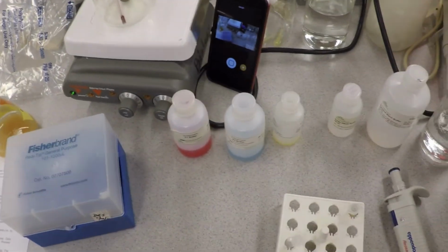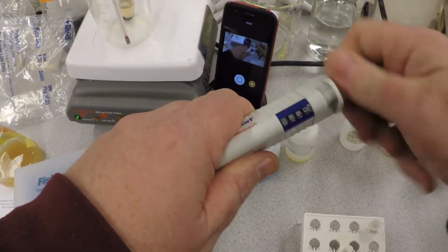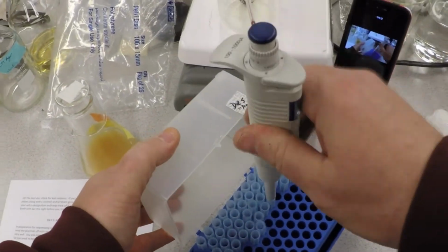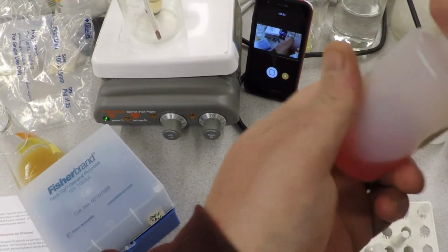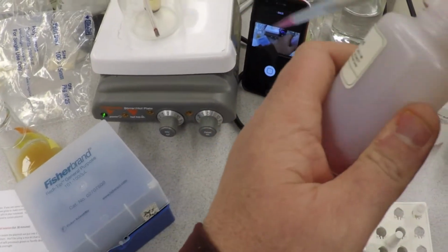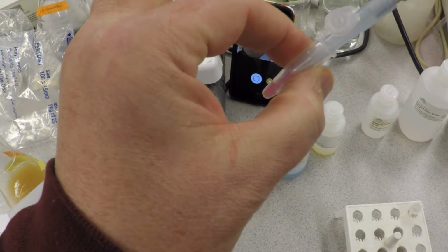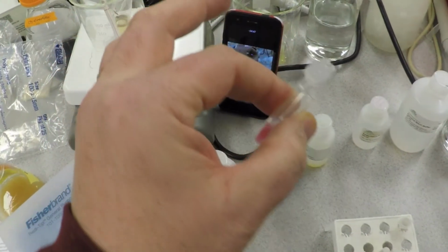All right. So it says now 200 microliters of P1. So you set your pipette here. This is basically an alkaline lysis protocol, by the way. Very simple, something that everyone uses. Very efficient, works really well. Here's our P1 buffer. They're color coded, which is nice. So it says 200 microliters and resuspend completely. So we take our 200 microliters. We resuspend completely by repeated pipetting up and down, just like we did before. There she is. Completed.